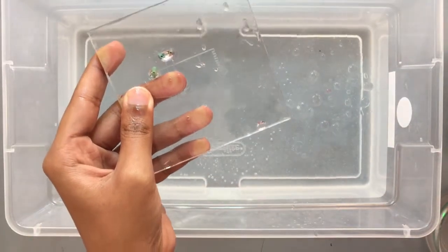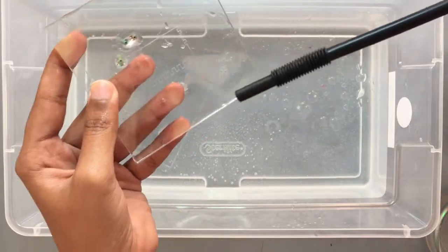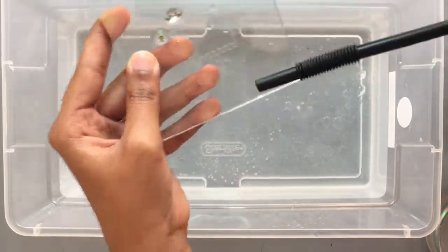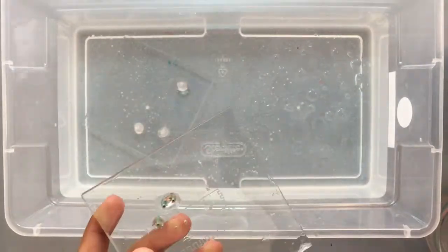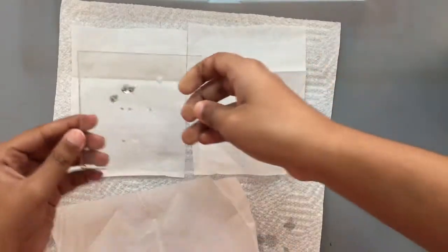Use compressed air to remove the rubbing alcohol and water until the chip is dry. Place the clean chip layer on a paper towel or kim wipe.